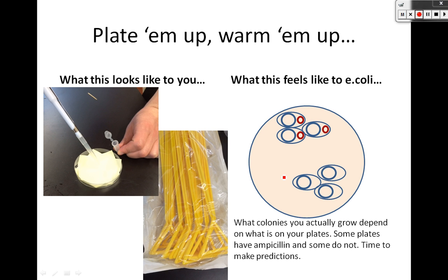And you're actually going to have 4 Petri dishes. And so on the next slide, I'll show you what you have. But you're going to take 100 microliters and plate that directly into the center of your agar dish. And then you have a choice as to whether you use a spreader. So this is a spreader, and you take the spreader and orient it, so this is the bottom part of the spreader. You'd orient it like this, and then just spread around once in a clockwise direction, like so. You could do once in a counterclockwise direction, it really doesn't matter.